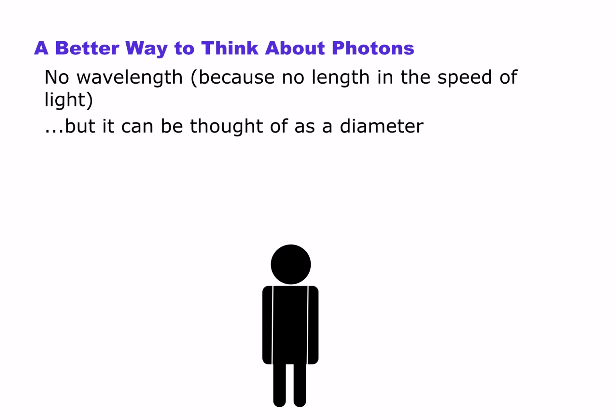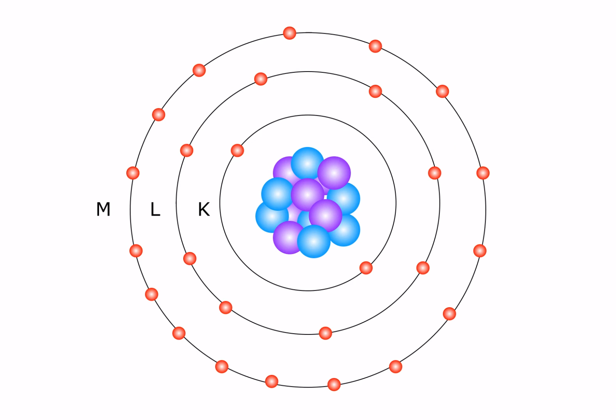Now, we've covered photons, we've covered some interesting ideas about photons. It's time to get to the basics of X-ray fluorescence and come to the atom. Now, this atom has 3 distinct orbitals pictured, K, L, and M. There's a couple different ways to remember this. I think of KLM, the Dutch Airways Company. You can also think of MLK, or Martin Luther King. Whichever is best for you.